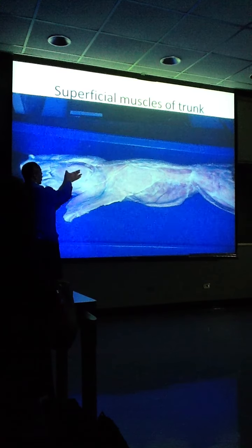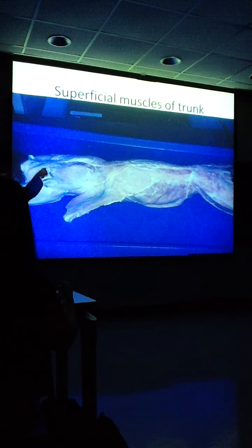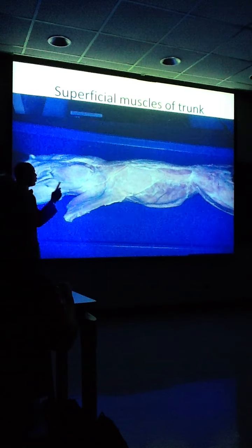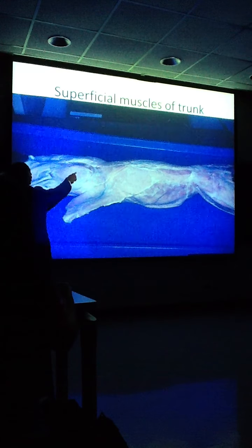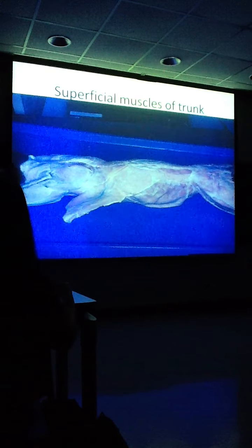Now, Mr. Gilmore, what's this fellow right here? His name is acromiotrapezius. So that makes this muscle here acromiodeltoid. Mr. Gilmore, what's this muscle right here? Clavotrapezius, that makes this clavodeltoid. So, Mr. Gilmore, in order, it will be spinal trapezius, spinal deltoid, acromiotrapezius, acromiodeltoid, clavotrapezius, clavodeltoid, in that order.